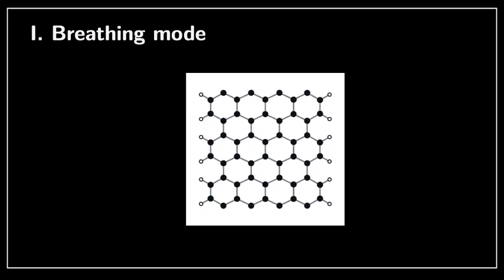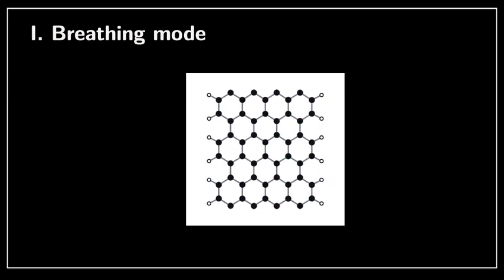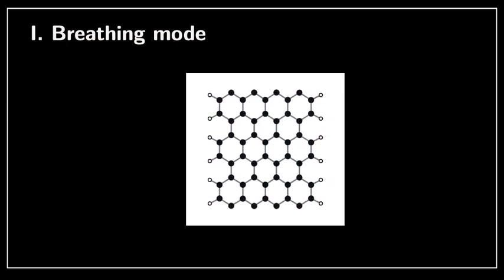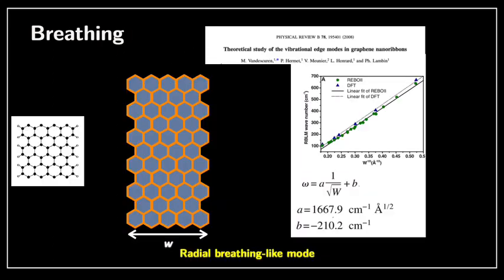And you see here that this is indeed a collective motion. And this motion, in fact, leads to a change in polarizability of the material and therefore is Raman active. So these are works that have been done for a while. In fact, theoretically, they were studied well before they were obtained experimentally.